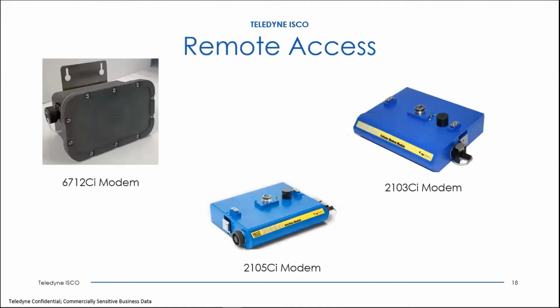Another thing to consider, if it's going to be a remote location, is that we have modems you can actually hook up to the samplers. The modems help you interface with the samplers. They can tell you when the sampling routine has started and when it's done. They send out text messages to tell you what's happening with the unit. You can even contact the unit and pull the data off remotely, so you don't have to make a site visit.